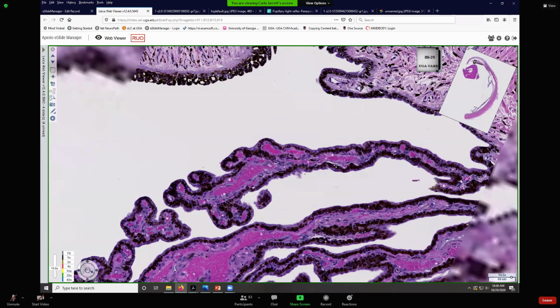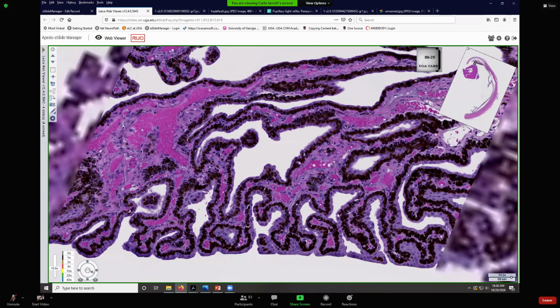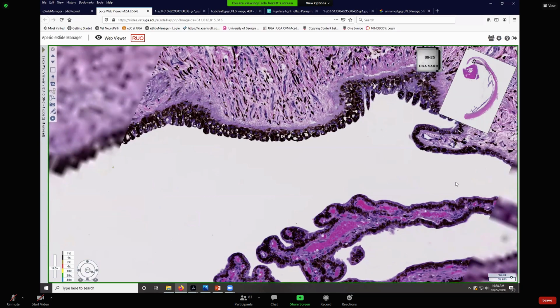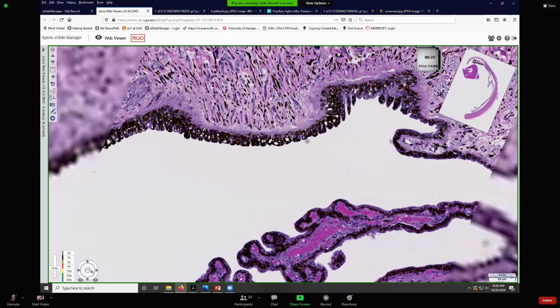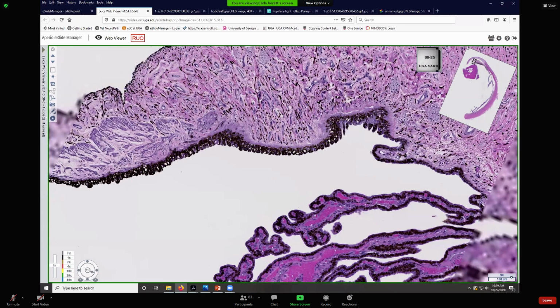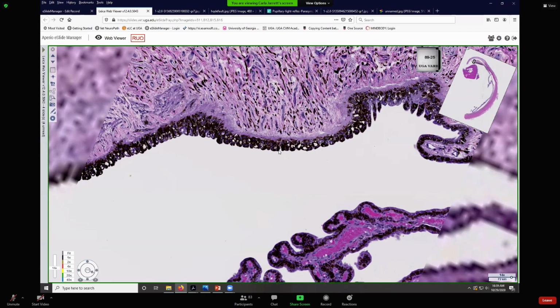Here on the ciliary processes, you can see our two cell layers, our inner non-pigmented and our outer pigmented. On the iris, which is the continuation of that bilayered epithelium of the non-visual portion of the retina, both layers became pigmented. So we no longer have inner and outer differences. They both are pigmented. They look the same. Now we're on the iris, so we're not going to call them inner and outer anymore. We're going to call the two layers anterior and posterior.